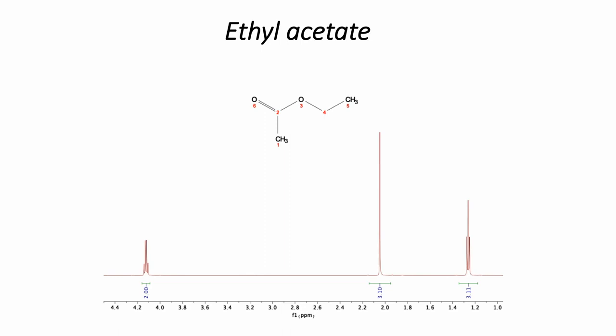You can use NMR solely as a fingerprint and tabulate it: I know that only such and such resonances come at, we'll call that 2.01. And so you can go look in a table and say, oh, this must be from one of this small subset of molecules because they only have something at 2.01.